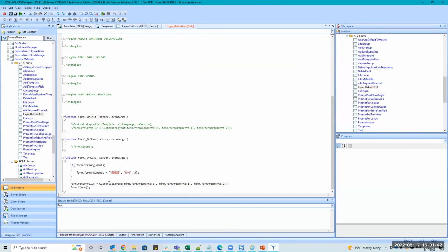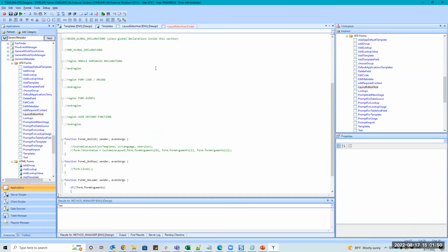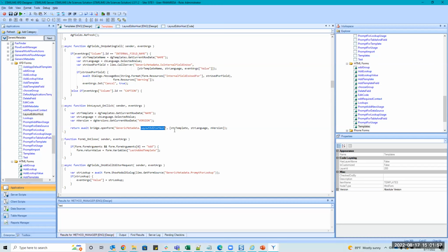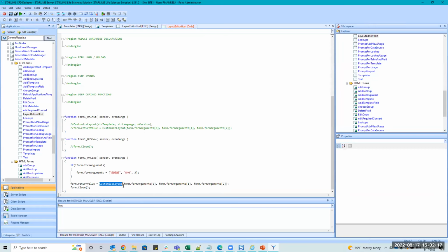So this function here doesn't exist. Okay, so this is inside of a client script. So this is the first look at a client script, but I'm not going to keep going down the spider web. We're going to stop here. So in order to click that button and open up that form, this is really what's needed. Some type of this syntax here, bridge, open form, and then you give it an XFD form. That's kind of like your host. And then this form here is responsible for doing whatever it needs to, right?